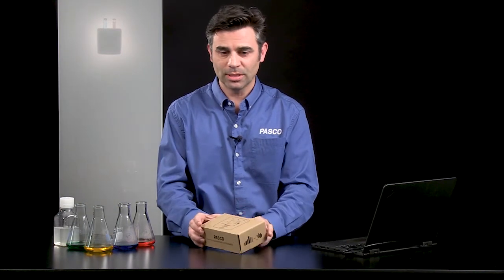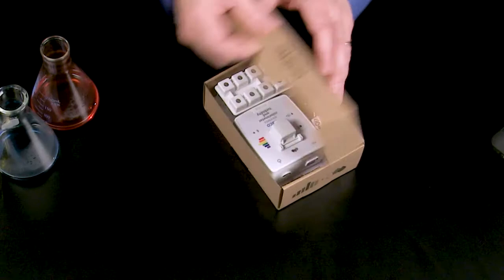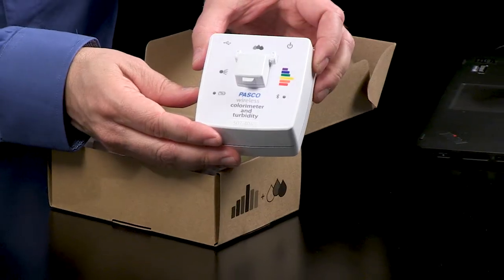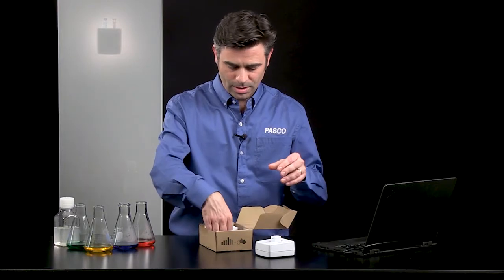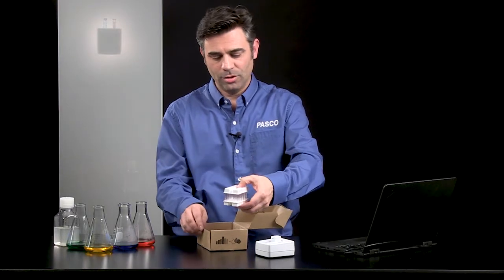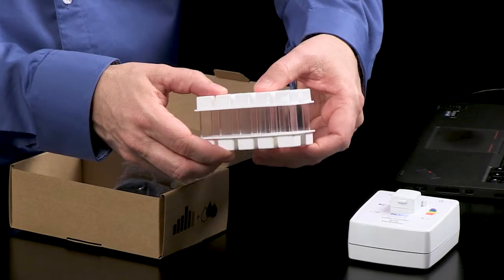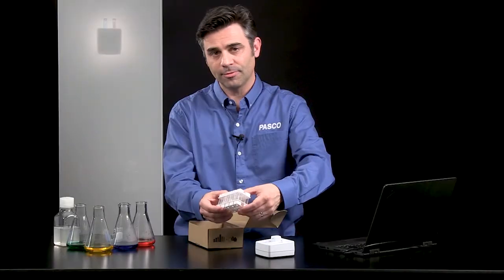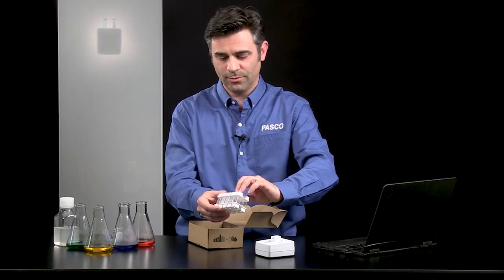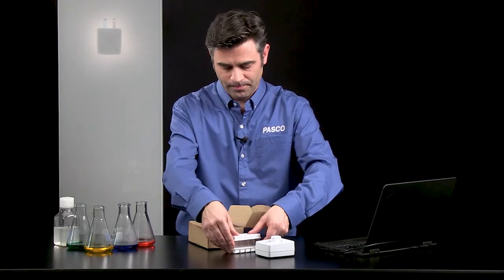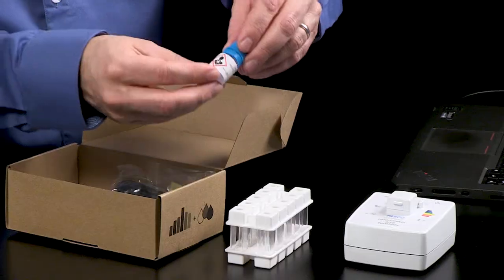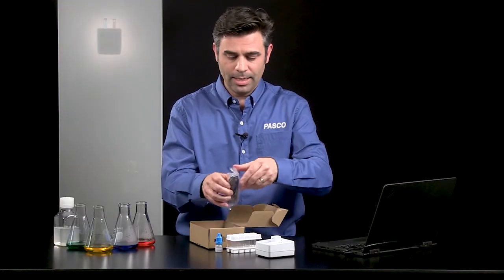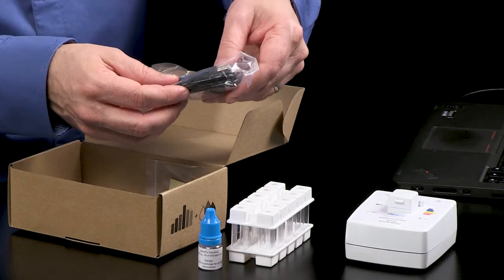So let's take a look at what's in the box. When I open the box, there is a wireless colorimeter and turbidity sensor. There are cuvettes and two cuvette racks. There are 10 cuvettes total, six of them for use with the colorimeter, and four are four clear sides for use with the turbidity sensor. There is a 100 NTU standard for calibrating the turbidity sensor, and there is a USB cable for charging.